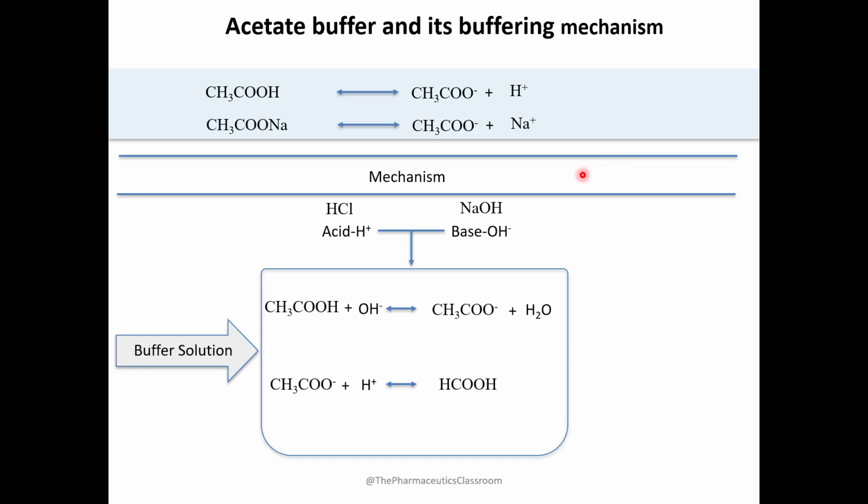Now we'll see the mechanism of action of a buffer. This is a very typical example of a buffer. Buffers are composed of a weak acid and its salt. We all know weak acids do not completely dissociate; they dissociate partially.